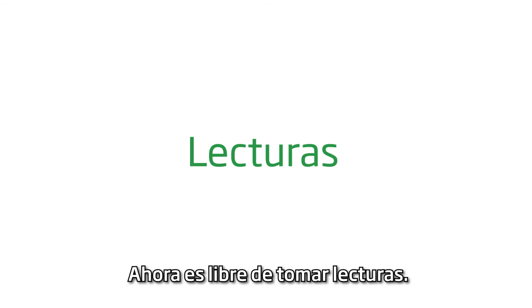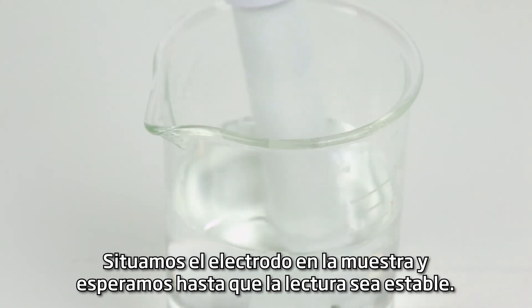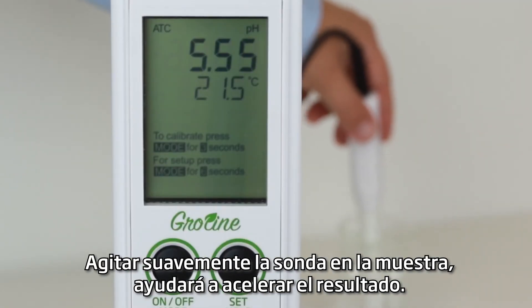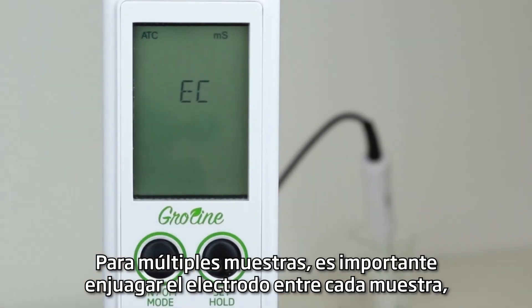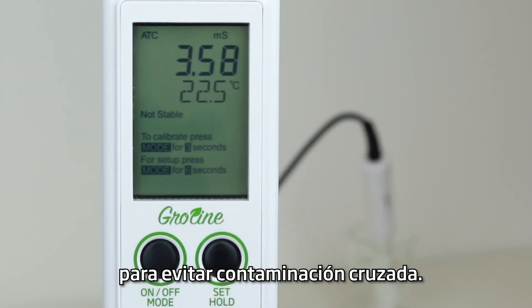You are now free to take measurements. Before taking a measurement, rinse the probe in distilled or deionized water. Place the probe in the sample and wait for a stable reading. Stirring gently will help speed up the results. Pressing the set button will allow you to change between pH or EC readings. For multiple samples, it is important to rinse the probe between each sample to avoid cross contamination.